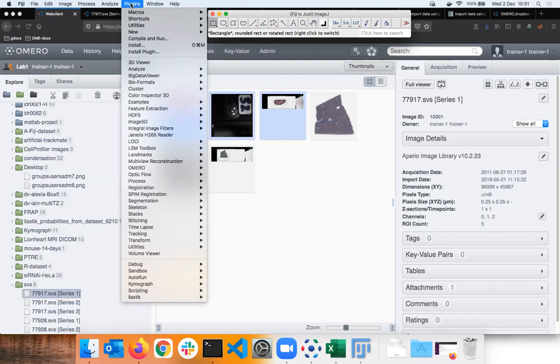So step one, I get my image out of OMERO into Fiji environment, do my magic with Fiji on it, some analysis producing regions of interest, measurement tables, and new images, and put those things back to OMERO to an appropriate place. How do I do that?